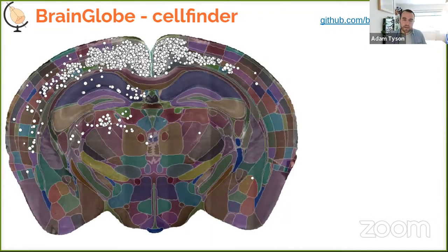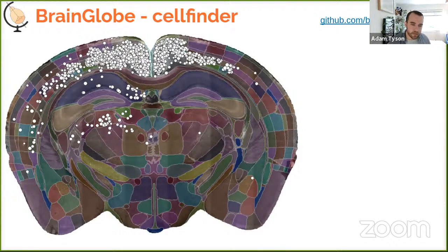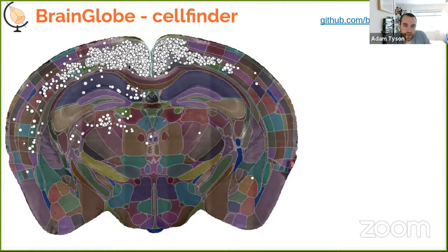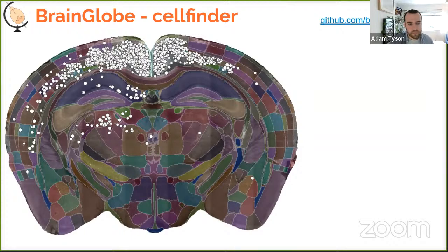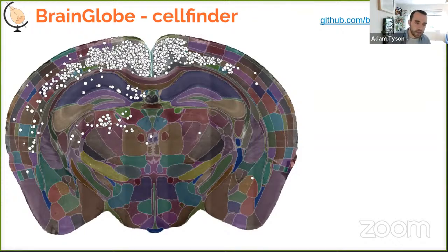CellFinder combines the cell detection and registration pipelines for fully automated processing of whole-brain images — in principle for any species with an atlas. It performs 3D cell detection, segments the brain based on atlas registration, assigns each cell to a brain region, and enables quantitative comparisons of cell distributions between brain areas or experimental groups. We validated this by comparing automated results to manual expert counts.